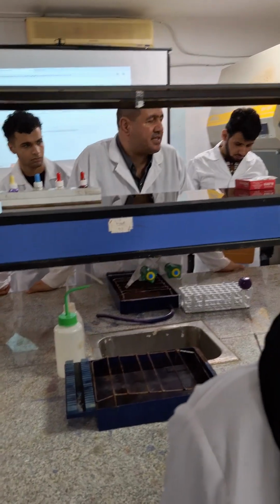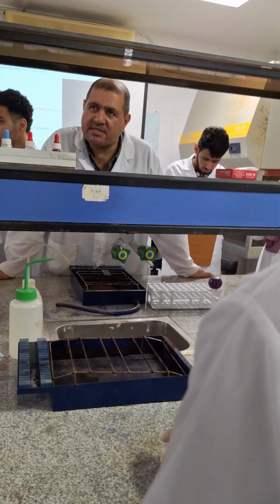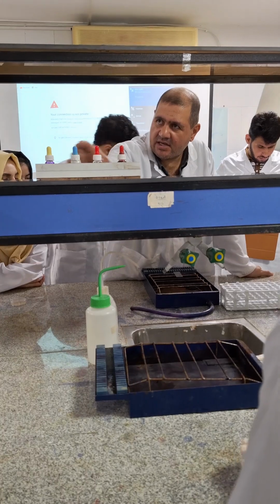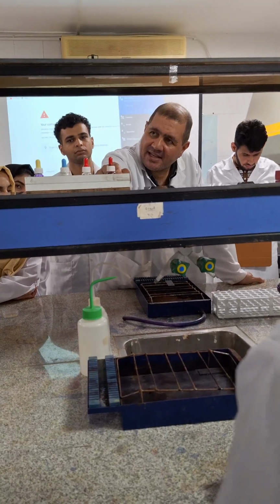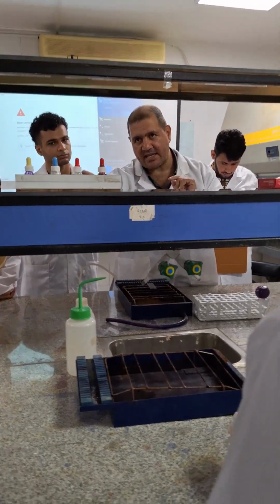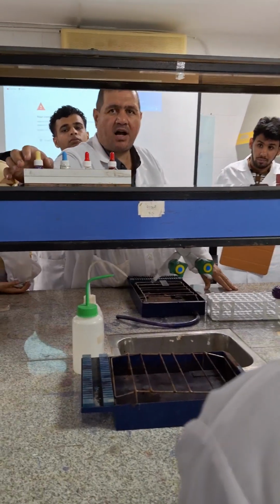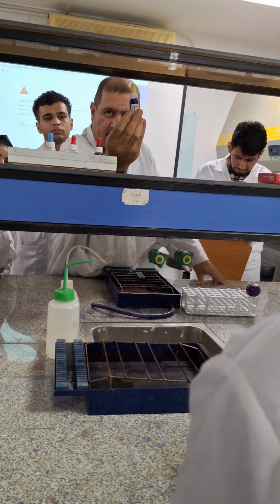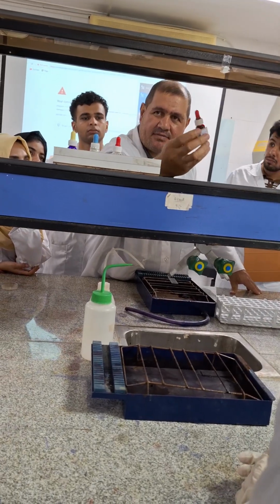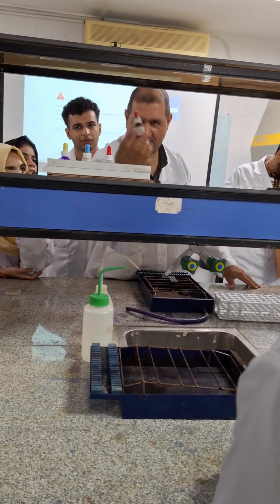In differential staining, we use two or more stains. For example, in gram staining, we use crystal violet and safranin. After staining, you can distinguish bacteria according to their reactions to the staining method. Gram positive from gram negative. Gram positive color is violet, purple. Gram negative is red, safranin, pink.